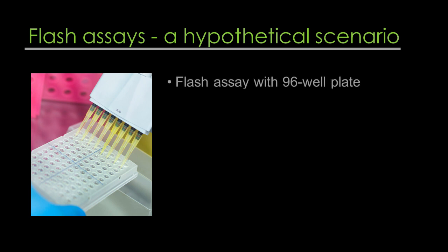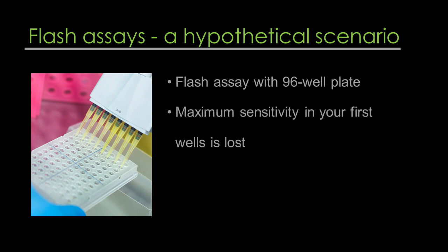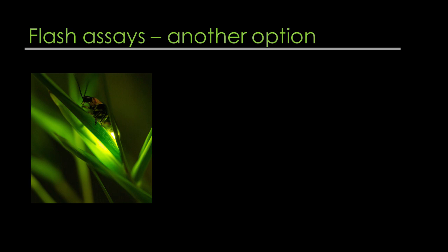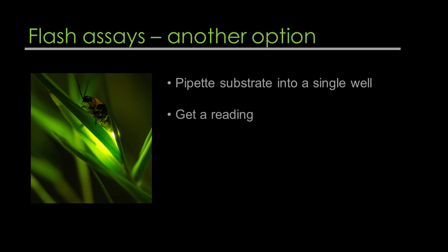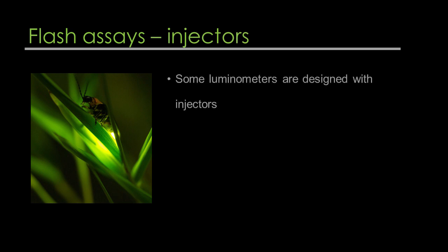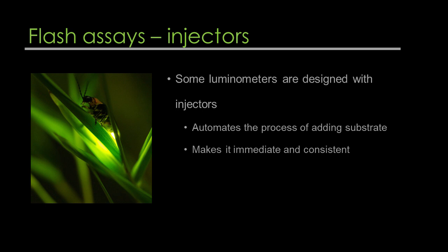Consider a hypothetical scenario working with a 96-well plate doing a flash assay. If you were using a multi-channel pipette, because the assay runs so fast, by the time you finish pipetting into the final wells you'll have lost maximum sensitivity in your first wells — making it impossible to get an accurate reading. An alternative is to pipet substrate into a single well, get a reading, and move on to the next well, 96 times. Some luminometers are designed with injectors that automate adding the substrate, making it immediate and consistent, ultimately solving the problem with many samples. However, these luminometers require more substrate, as some substrate is always lost.